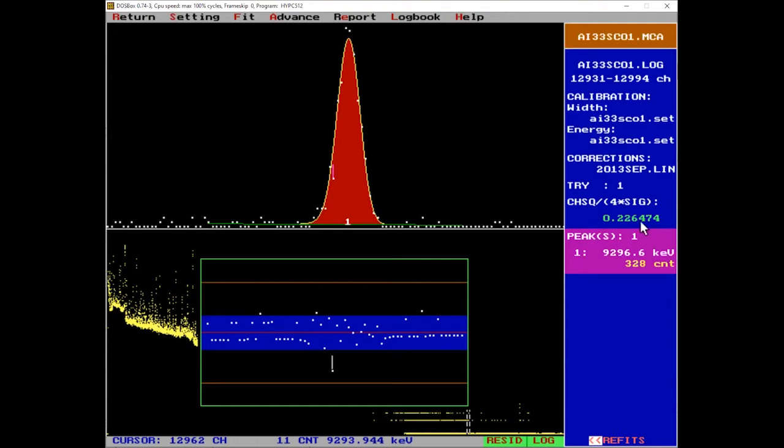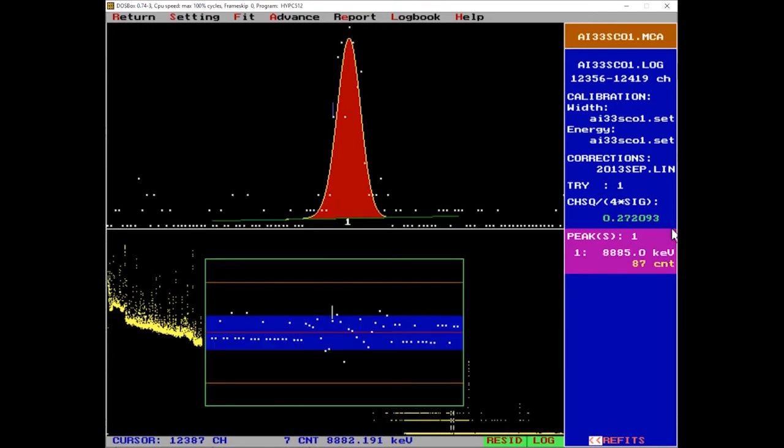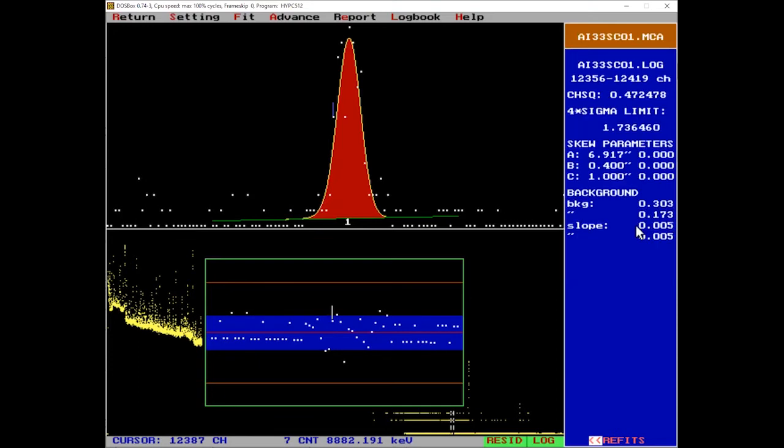And if it is shown in green, that means that you did a good job, or the program did a good job, and this region is, from a mathematical point of view, well fitted. From a spectroscopic point of view, it can still be improved if you are the spectroscopist, but mathematically speaking, it's fine. And wherever there is a problem, this value will be shown in red, and that means you have to improve the fit of that region.